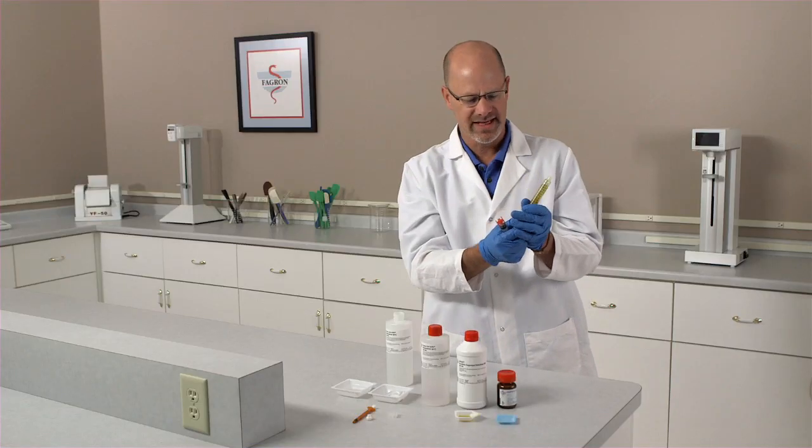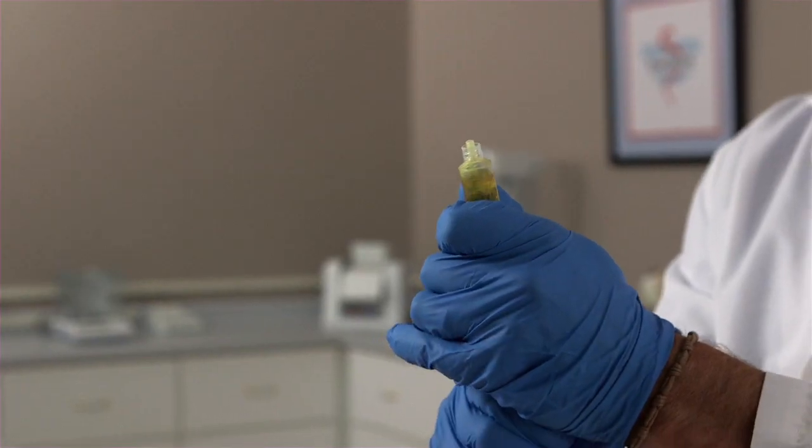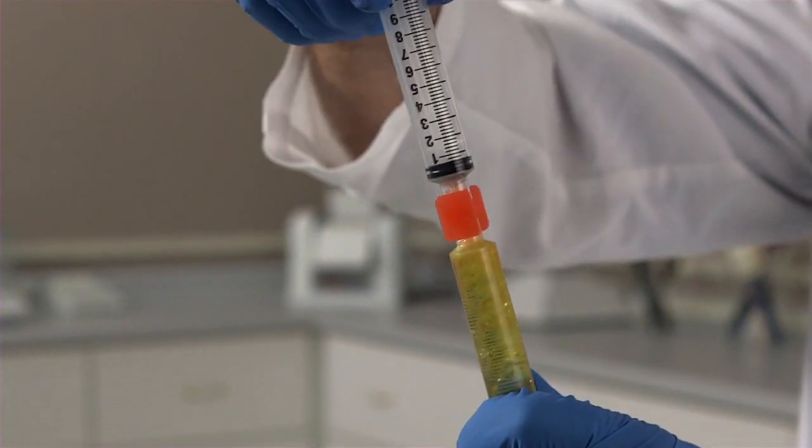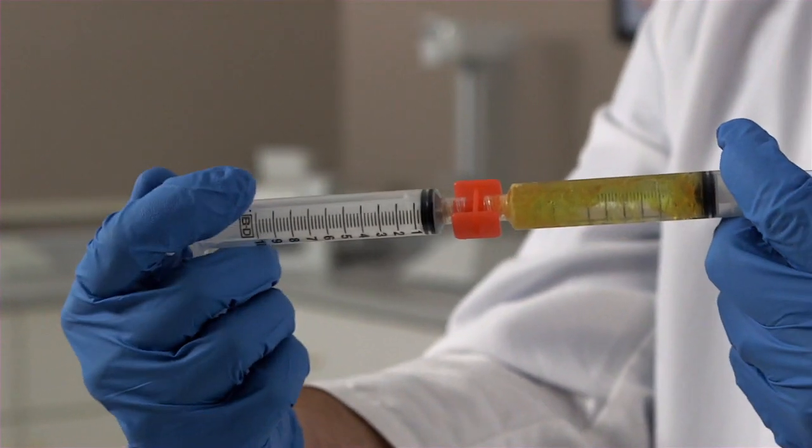We have to break the seal that is on the plunger. Then we can gently connect the two syringes back together. Now we can start our mixing process.